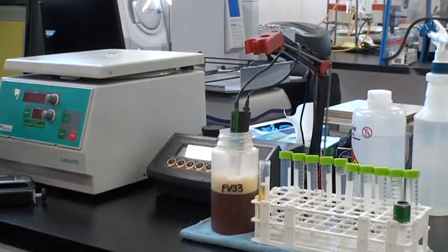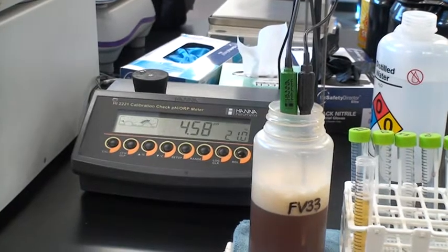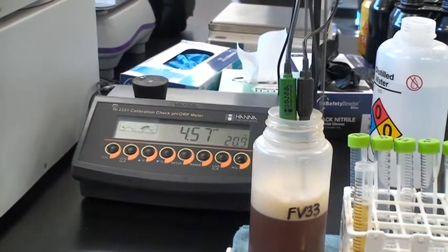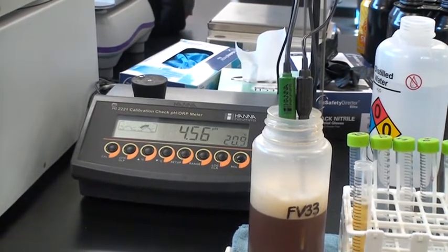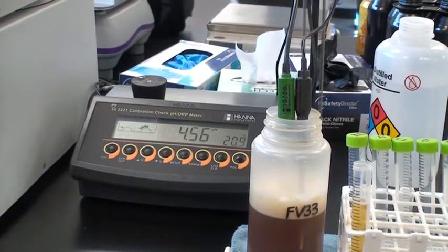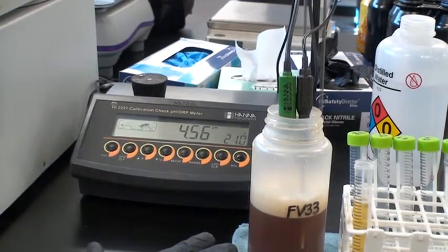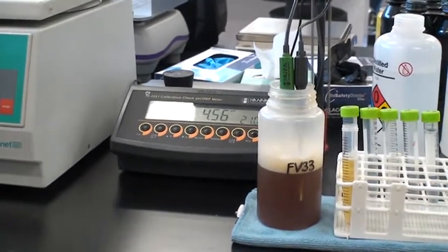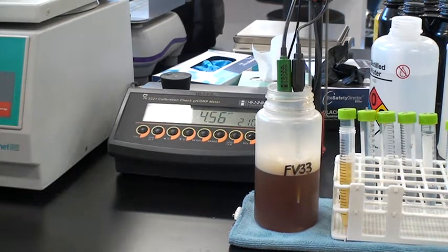Drop them in and let it equilibrate — it takes a couple of seconds. This batch is Amber Has Two Mumps, brewed yesterday. New beers will have a slightly higher pH, above 4.5. We always want to see pH drop below 4.5 at some point — that's the magic number for pathogenic bacteria. One of the great things about beer is it's not regulated by the FDA because Listeria, E. coli, Salmonella — none of those can survive in beer, largely because the pH is below 4.5. This beer is less than a day old, so pH is 4.56. That's great — right where you should be on day one.